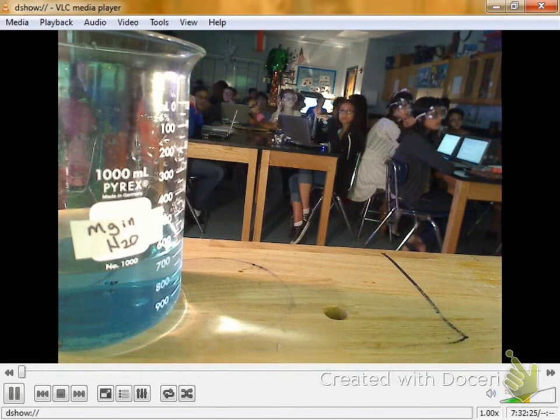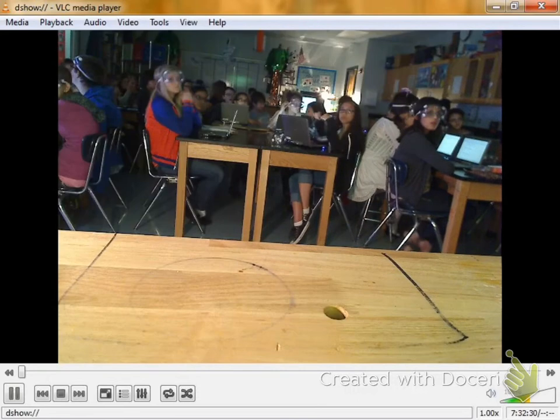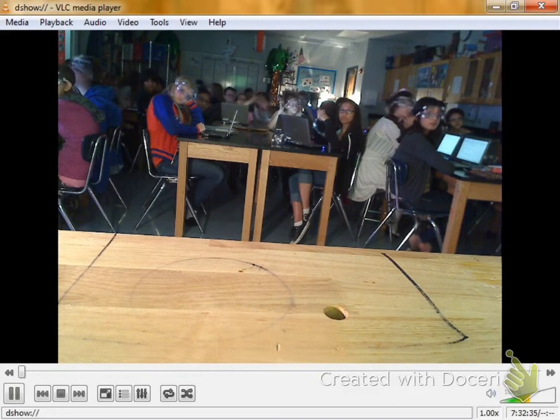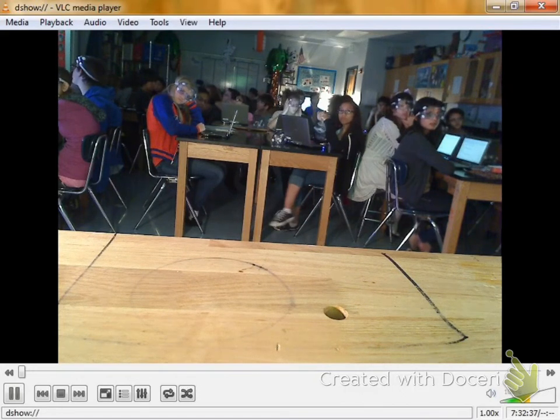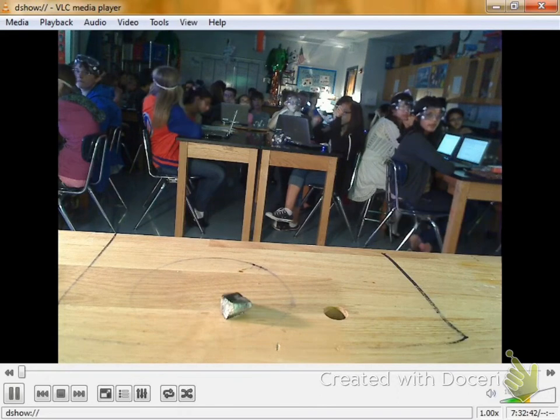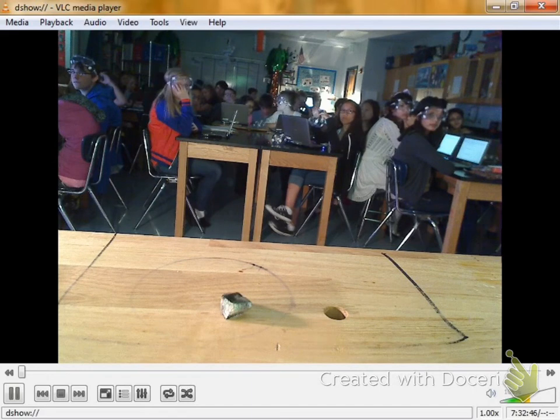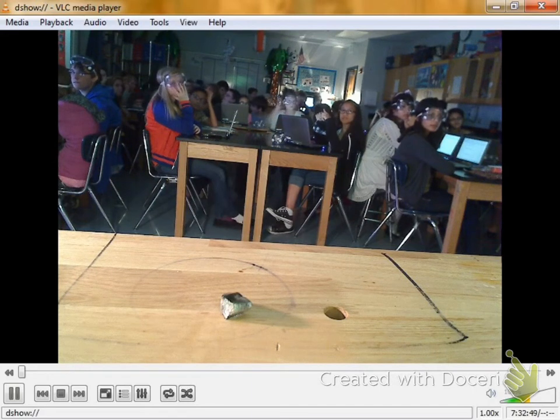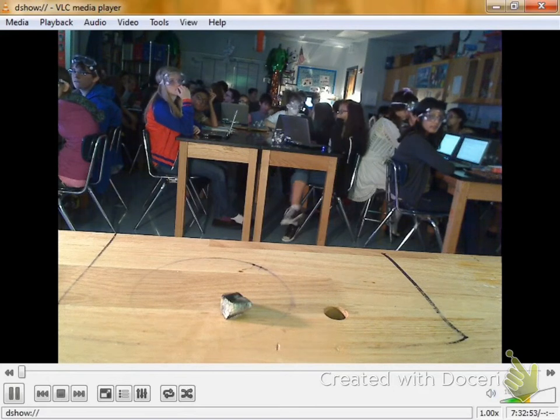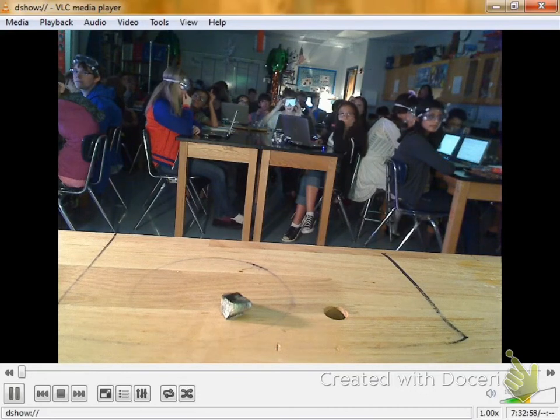So we don't have any solid, well, we have hydrogen gas, but that's not a solid. What's the first metal in the alkali metal family? Lithium. What's one of the properties of the metals in the lithium family? Remember, calcium I cut with the hammer and screwdriver. So, are they still supposed to be soft? Yeah, they have kind of low densities. They're soft, easy to cut.